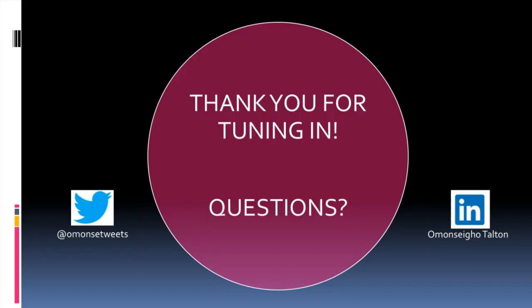That's a great question. Okay, so we'll talk first about indirect ELISA. Again, you have your antigen, and the antigen is being bound by a primary antibody, which typically is binding to just one site on the antigen. In indirect ELISA, you have a secondary antibody that has the ability to release the signal, because that's the one that's enzyme linked and reacting with the substrate.